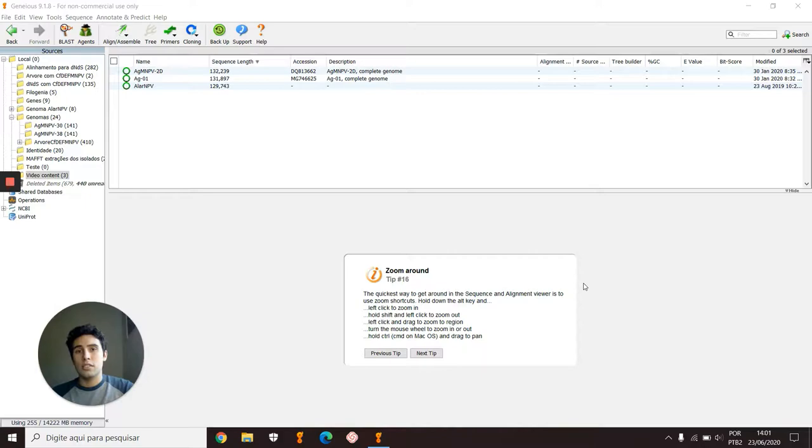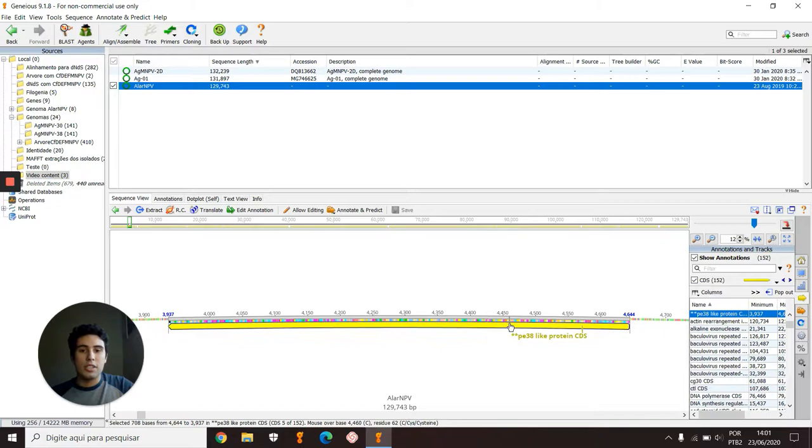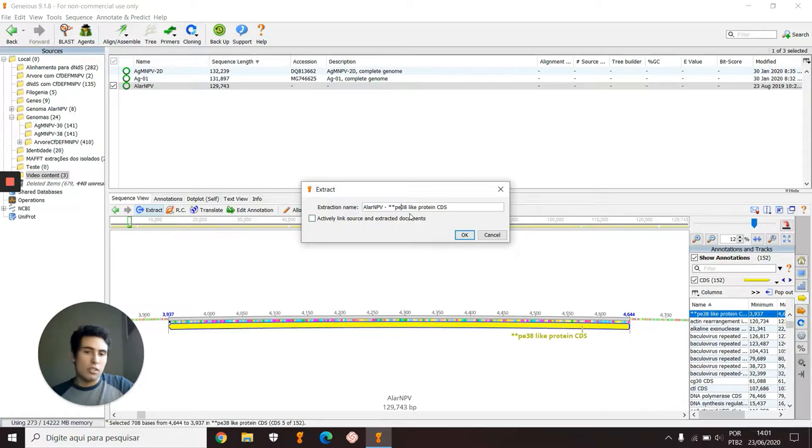Today I will show you how to extract, group, and align genes, and also how to do phylogeny in Geneious. Right here in this genome, if I want to analyze this ORF, this gene p38, I want to click here in Extract, and here I can choose the name of this extraction.